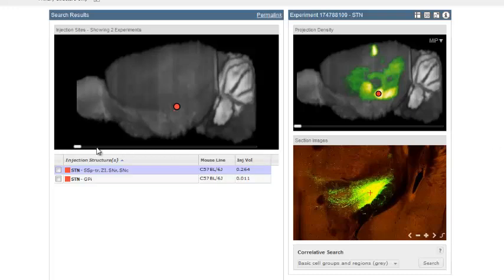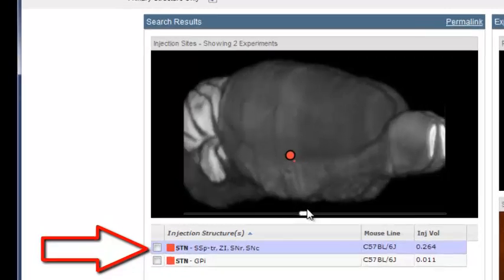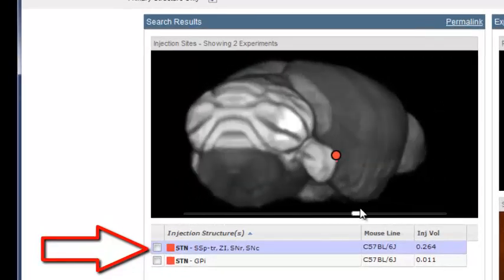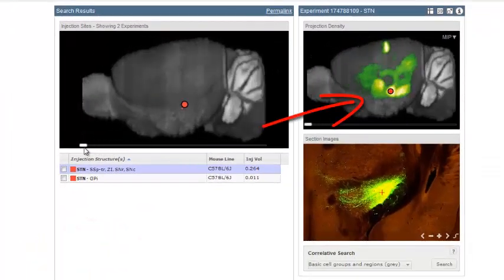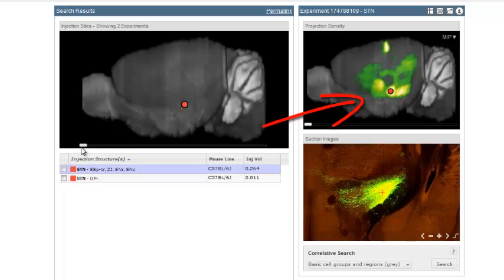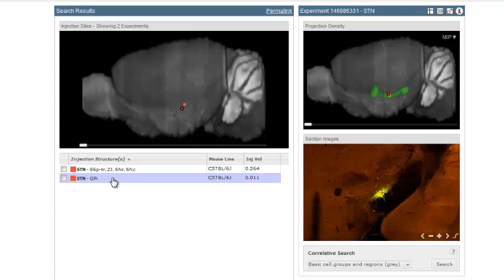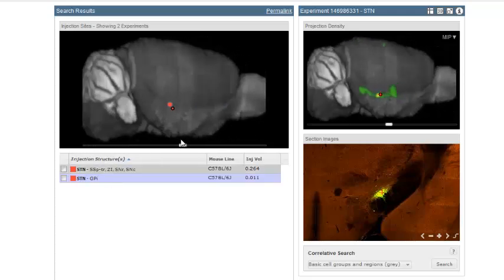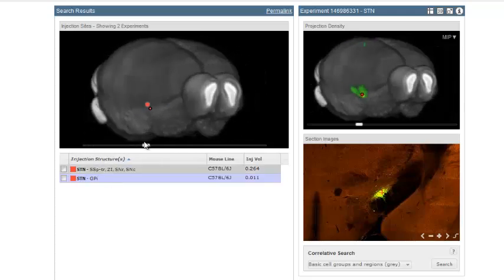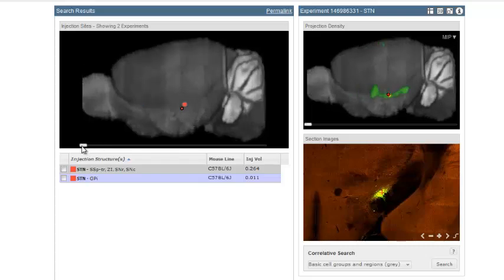Of these two experiments, you'll notice one has several secondary injection sites, some of which are not part of the system we're looking at, and you can also see extensive signal throughout the brain. The second experiment lists only the subthalamic nucleus and globus pallidus as injection sites, and shows signal in restricted areas of the brain. Let's take a closer look at this experiment.